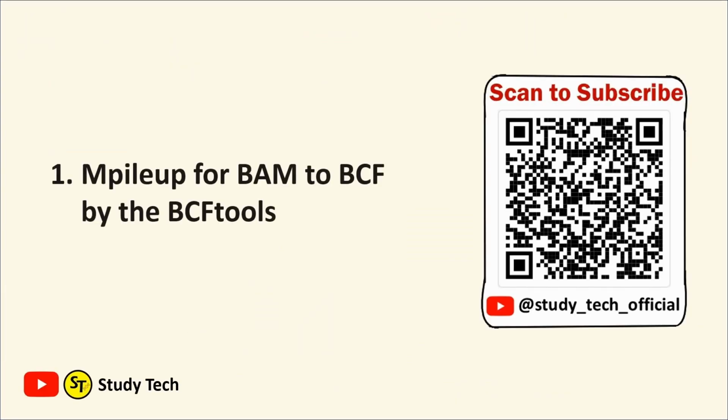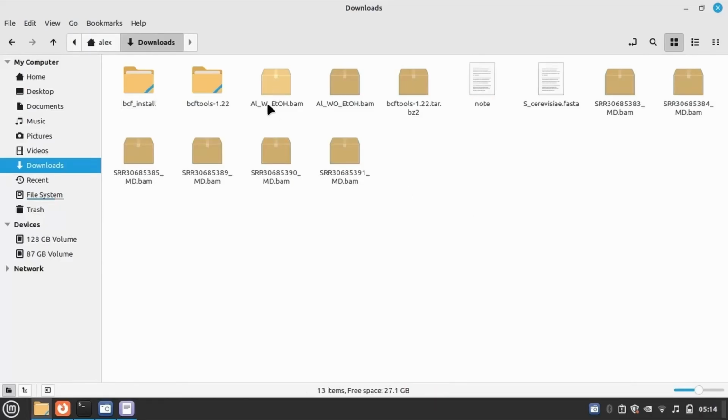So let's start with mpileup to convert the BAM file into BCF file. Here you can see it is the BAM file with ethanol sample, and this is the without ethanol sample BAM file.